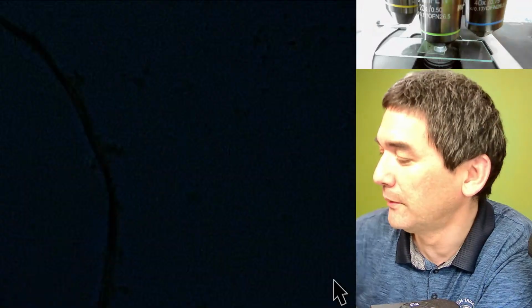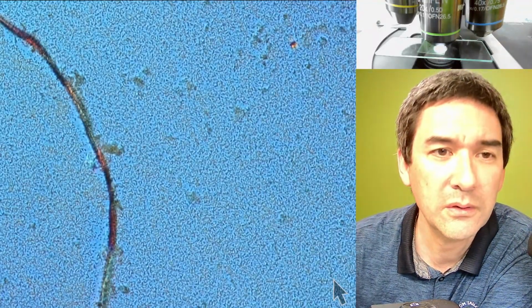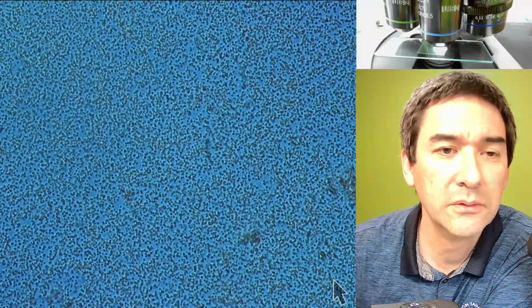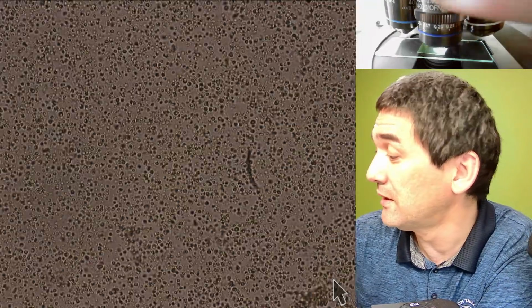We really have to go up a little bit with the magnification here, because it is pretty small. Wow, these. There, it is pretty small. Okay, let's use the natural. So I'm going to go up to 60 times.